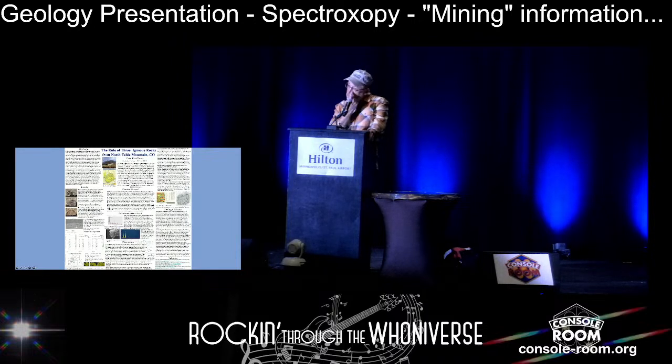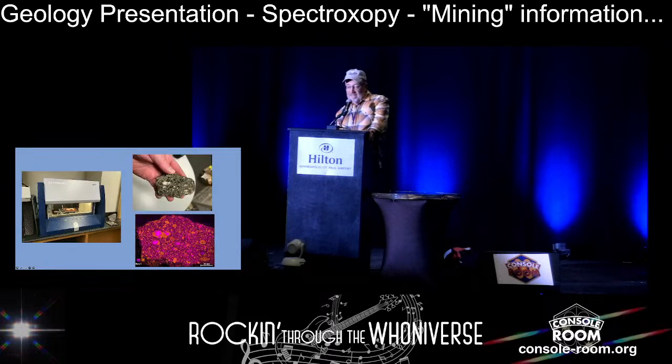So one of the students grabbed a sample, and she didn't grab it on this trip. She grabbed it back in Colorado. She lived in Golden, and there's a place called Table Mountain. She brought 3 different samples, and I said, let's run them all. And so we did. If you've been to the North Shore of Minnesota, a lot of the volcanic rocks there contain secondary minerals in the void space. We call those amygdules. Agates are one of them, thomsonite is another one. We see very specific zeolite minerals up there. This was different. I knew what it was, but I knew it was different than we typically see. Those white circles you see there are void space vesicles, gas bubbles that have filled in with secondary minerals.